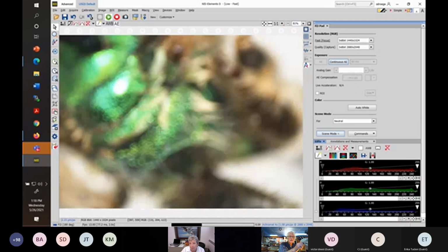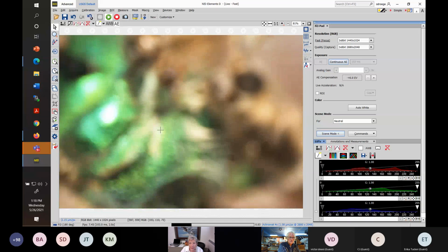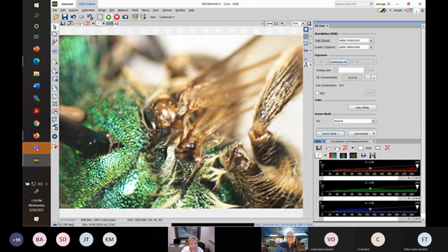So if we zoom in here, I'll point out the different segments we're learning. Got to get in focus. So the pin, as it almost always does, goes through the scutum. This is the biggest chunk on top of the thorax. There's a tegula. That's a wing cover for the forewing. There's the hind wing.